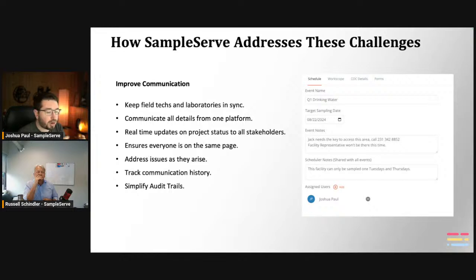If the project manager is in the office and the sampler says, "Hey, I can't sample in this location, is there something you'd like me to do?" the project manager can just look up the whole project and say, "I'm going to add this sample location for you real quick." It'll show up on their GPS if they have the GPS location in there, and they say, "Okay, I'll do that one instead." So it's really nice, easy, and simplified.